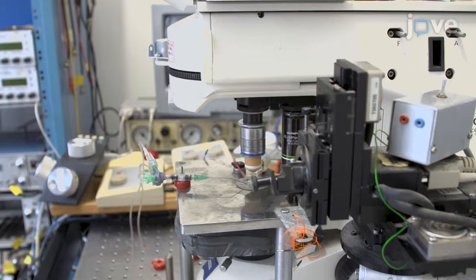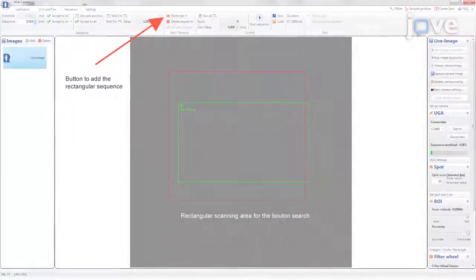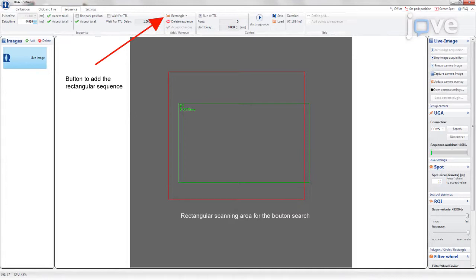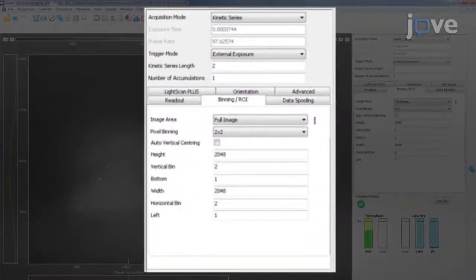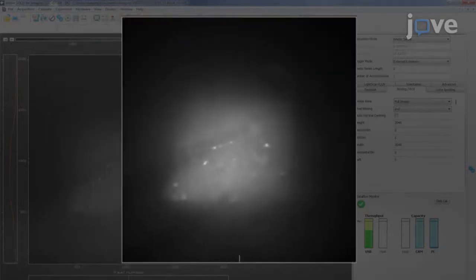Fix the slices with a nylon grid on a platinum harp to minimize tissue movement and switch to the 63x water immersion objective. Using a high-pass filter at 510 nanometers, acquire an image of the autofluorescent and glutamate sensor-positive structures together.